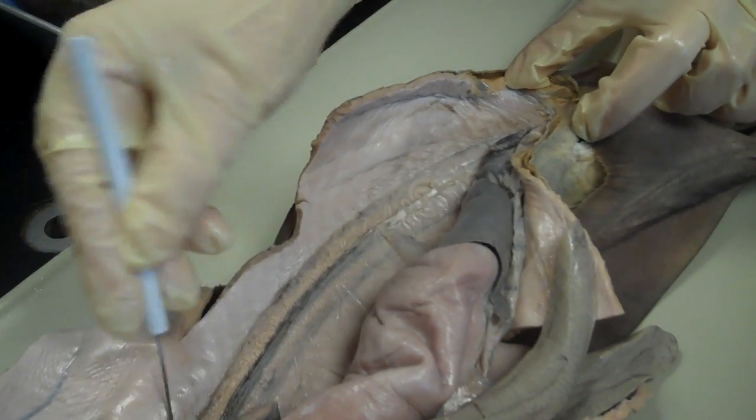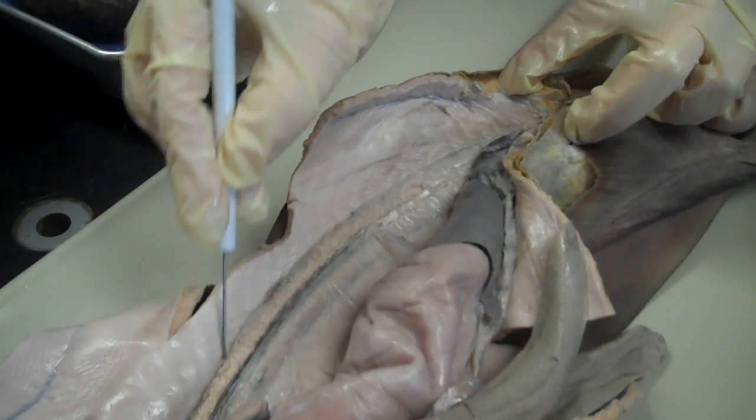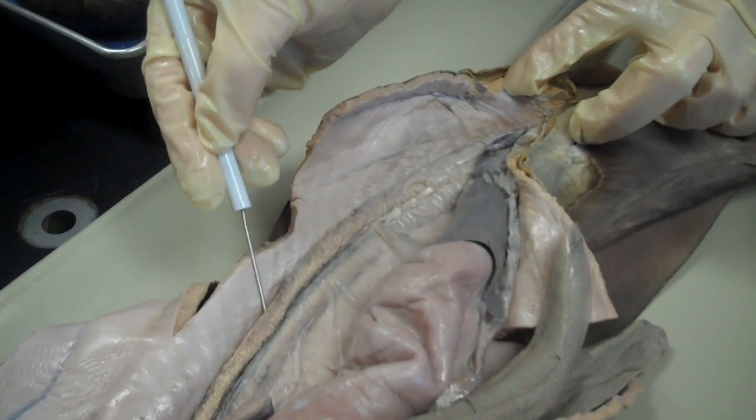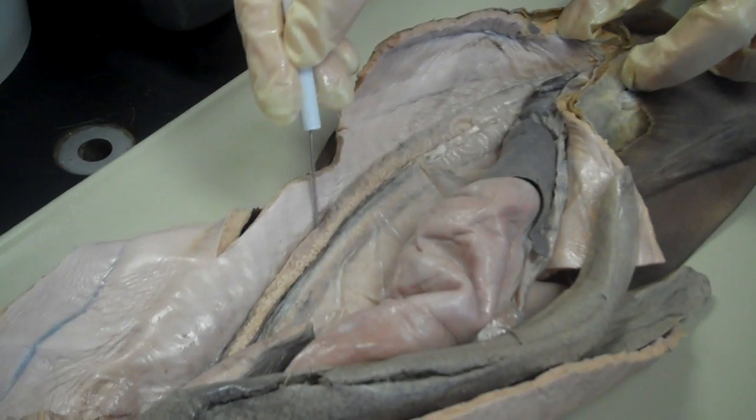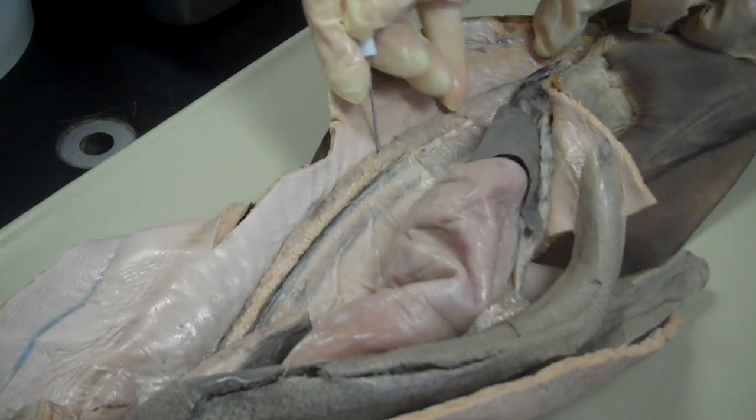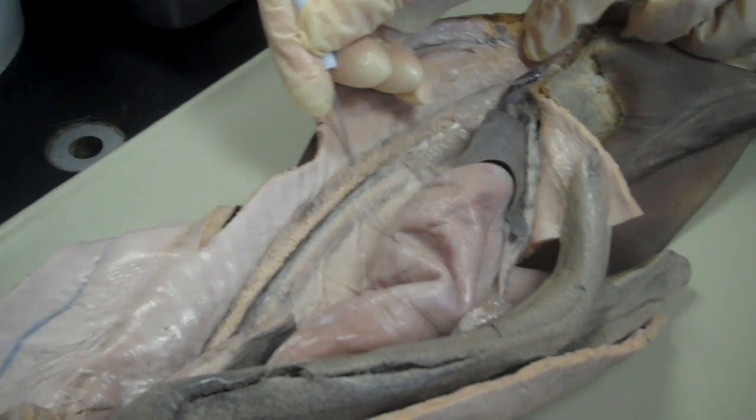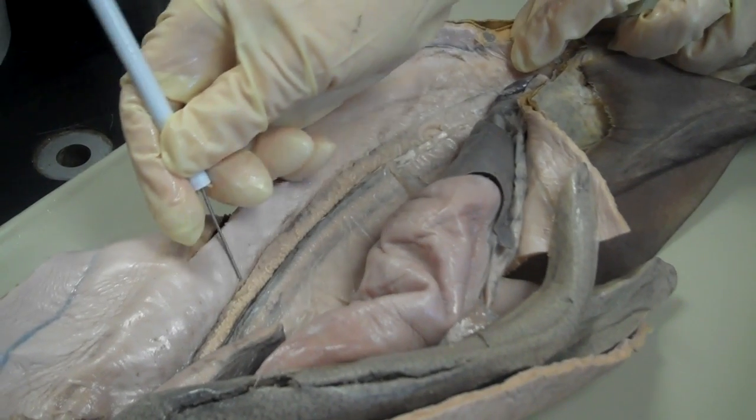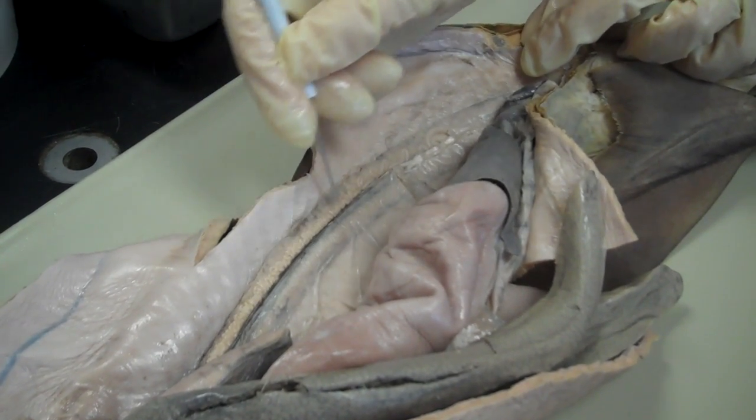Now all of those structures, the vas deferens and the seminal vesicles, all sit right on top of this flap of tissue. This is the kidney that is retroperitoneal. It's buried in the peritoneum in the dorsal body wall. So this is all kidney with the vas deferens on top.